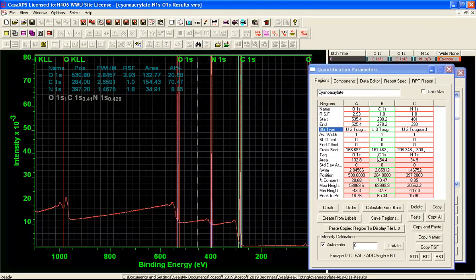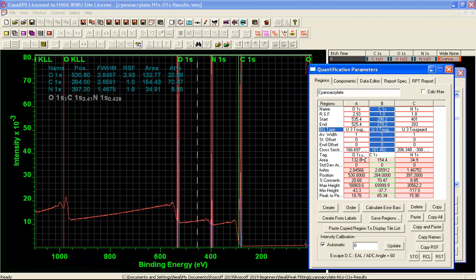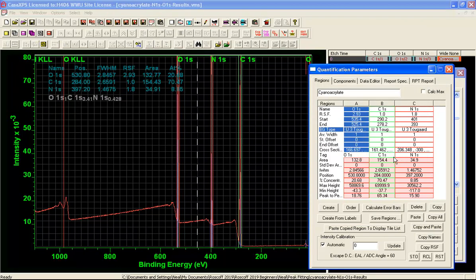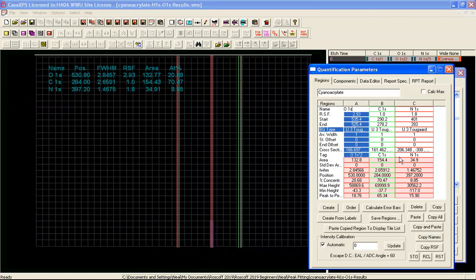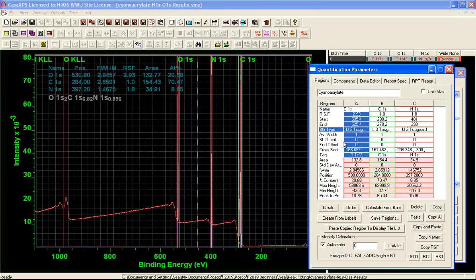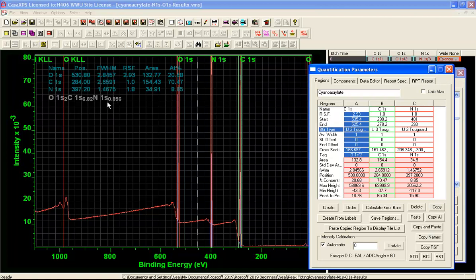So we have got annotation that represents a table giving us the atomic concentration and annotation that is a chemical formula using the information that is gathered from these regions and presented as ratios. Now I can actually improve the way these are presented if I then look at the oxygen in the tag field and I say star 2. We now have all of these values relative to the oxygen as if there are two atoms. So we have got 6.82 for the carbon and less than unity for the nitrogen.